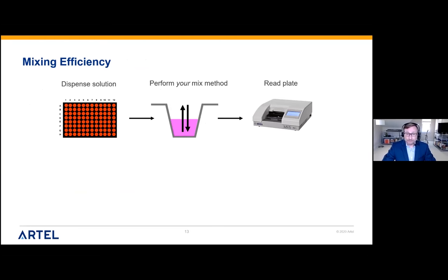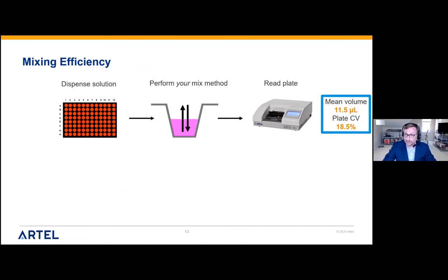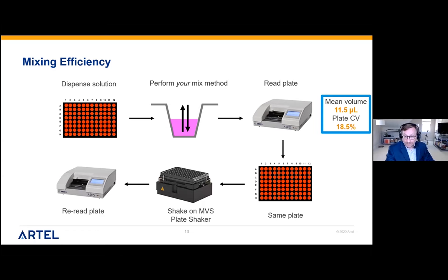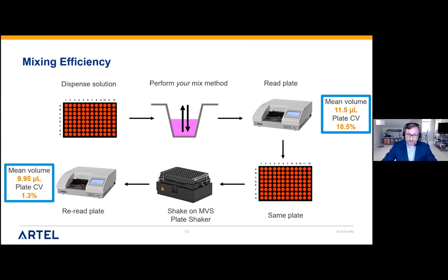For mixing efficiency: you dispense your solution, add your diluent, perform your proposed mix method, and read the plate. As illustrated, with a target of 10 microliters, we had a mean volume of 11.5 microliters and a plate CV of 18.5%. Taking that exact same plate, putting it on the RTL validated plate shaker — which has been rigorously optimized to combine reagents most efficiently — and reading again gives a mean volume of 9.95 microliters with a plate CV of 1.3%. This clearly shows the particular mix method employed was not sufficient.